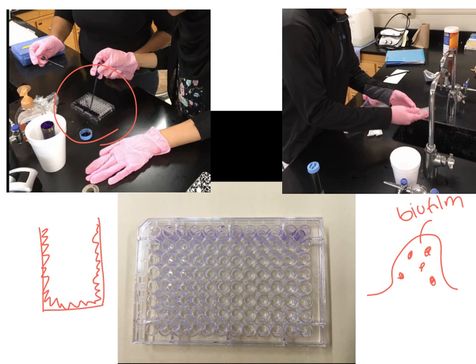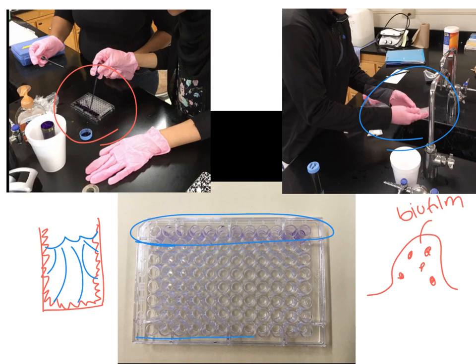So we then fill that plate with crystal violet, and that crystal violet will get stuck to the biofilm. We then rinse off all of the loose stain, and we end up seeing what looks like this. There is some staining in the plate, and what is stained is the biofilm. So a more purple color tells us that there has been more biofilm growth.